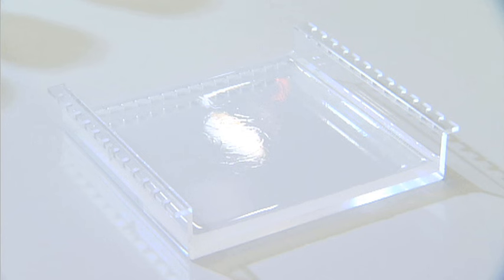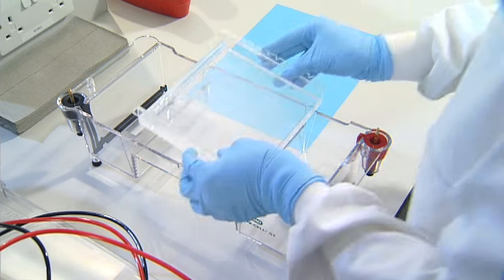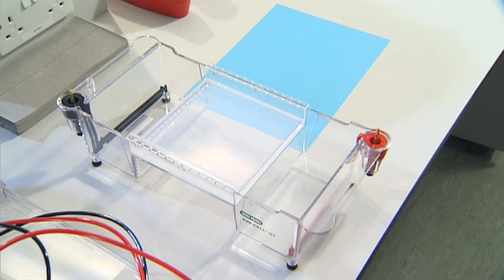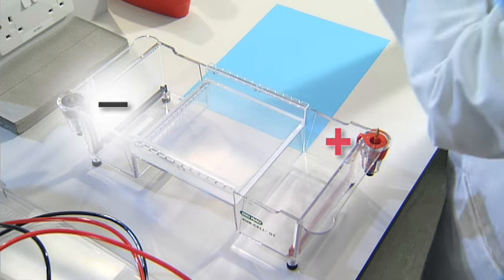Next, place the gel into the gel tank. The gel tank is a box with an electrode wire running across the bottom of each end, which allows the current to pass and separate the nucleic acid fragments. Put the gel on the platform in the correct orientation. Remember that nucleic acids are negatively charged, so they'll run through the gel towards the positive electrode. The positive electrode connector is coloured red and the negative electrode connector is coloured black.